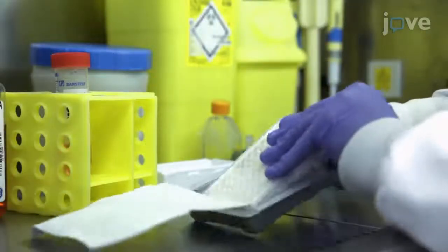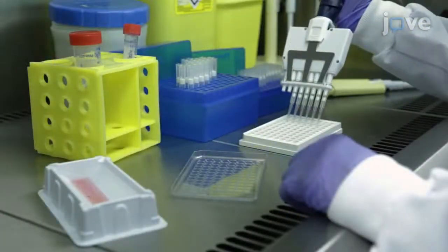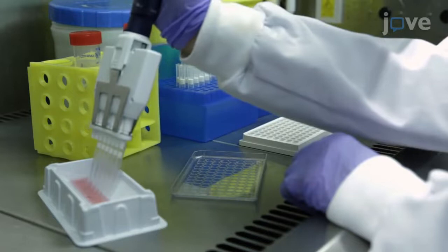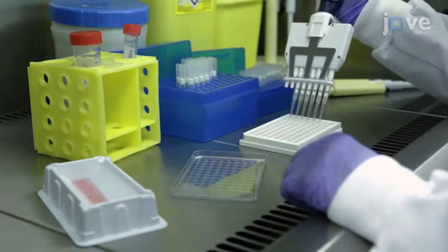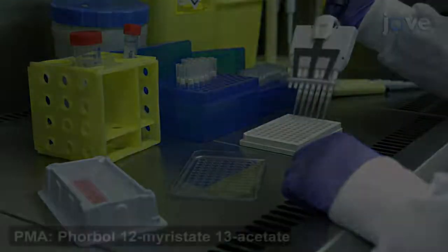Then, obtain a 96 well plate with a flat, clear bottom. For better homogenization, prepare 10 milliliters of THP1 cells in a 15 milliliter tube and add 200 microliters of PMA stock. Mix gently.